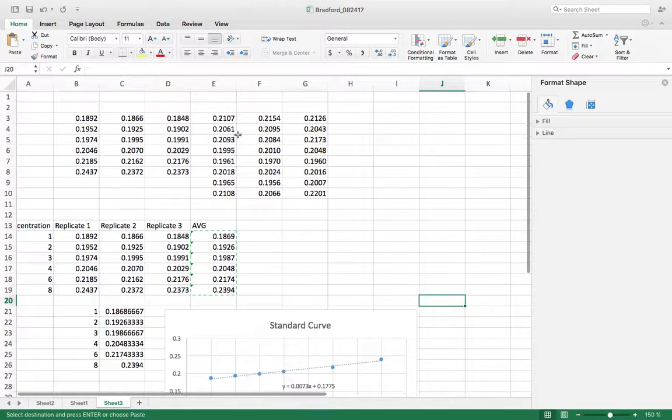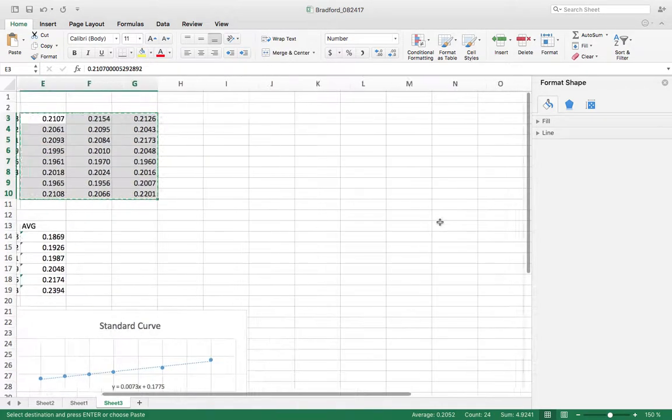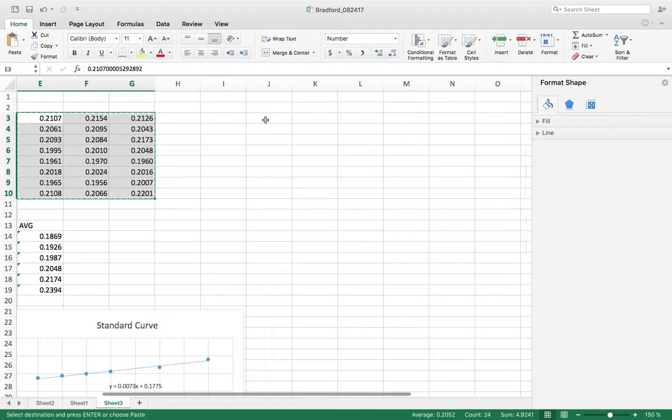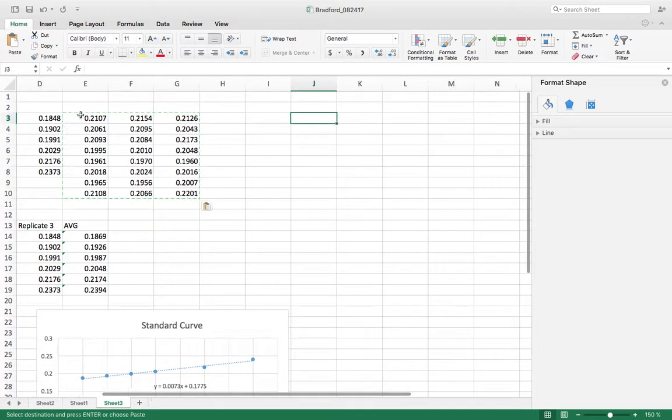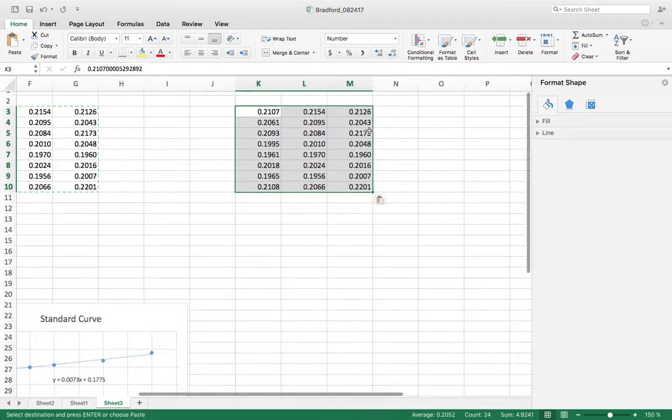Okay, so let's see our unknowns. These are 8 different cell samples that I use. So I actually break up human cancer cells. So I break up human cancer cells, and I measure them for their lysate, and the lysate is what the proteins are contained in.